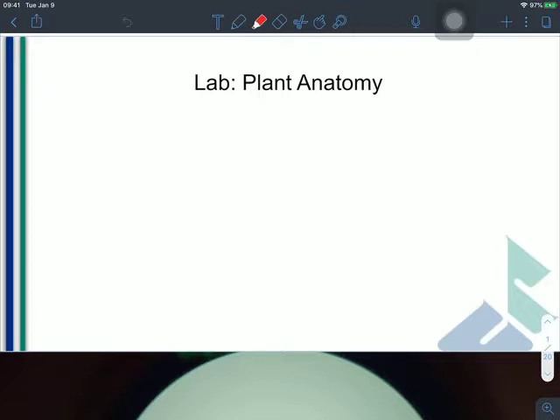Well, hello, everyone. For this week's Life Science Lab, we've got a lot of microscopy. Last week we talked about general trends in plant diversity, and we spent a lot of time in the greenhouse looking at different types of plants' morphology, how they look different, how they grow differently. This week we're going to take a lot of those different plants and look at them under the microscope.